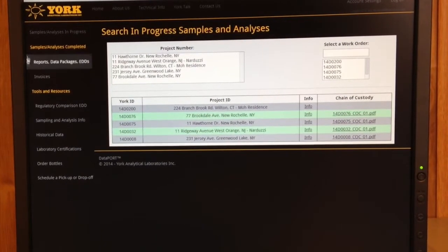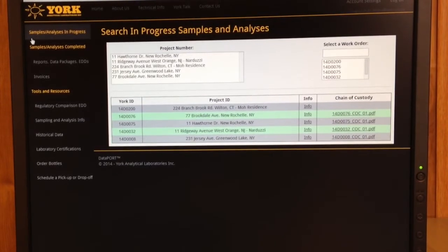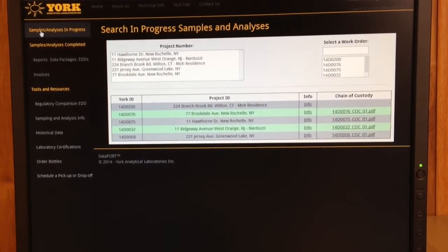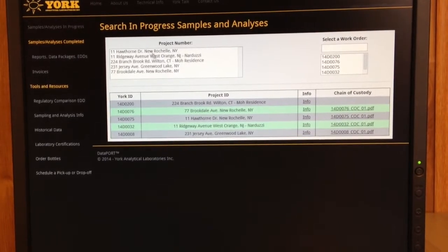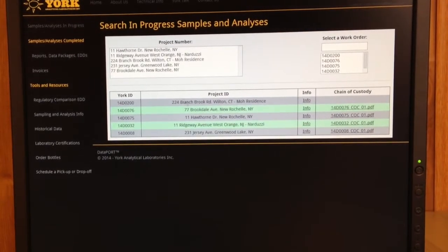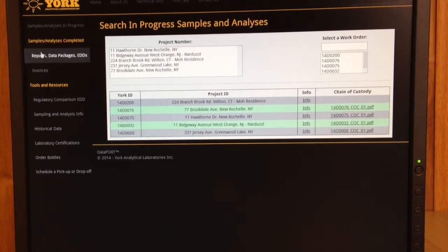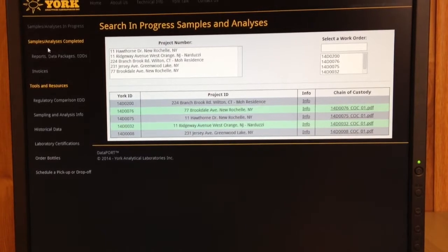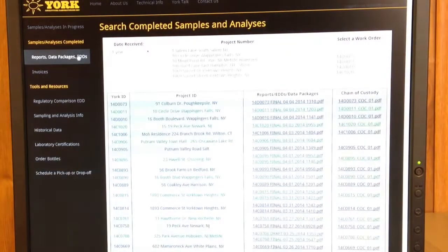Here in the data port, you'll notice it looks a little bit different. Up at the top, you've got samples and analysis in progress — anything that's currently going on at the lab is accessible right here. Things that are finished are down underneath in reports, data packages, and EDDs.